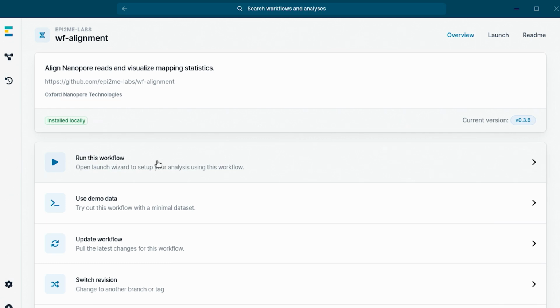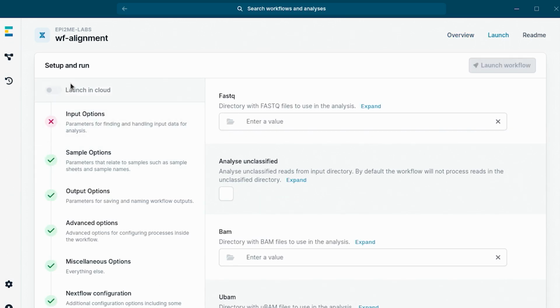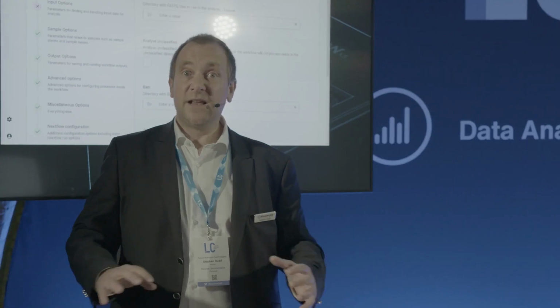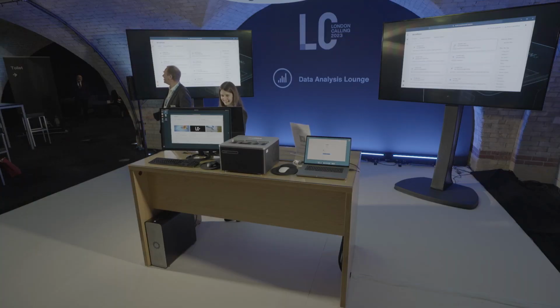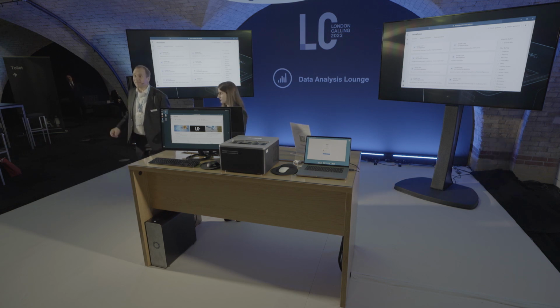What you do is you just specify that you would like to work with the cloud, you build a little bit of infrastructure, you submit your jobs to the cloud. The jobs run in your own environment, it's clean, no data is retained, lots of data is returned. Hey, everyone was listening, I like that. Anyhow, you get some glorious results back, you get some beautiful reports, and lots of data that builds confidence. Anyhow, let's have a look at a couple of examples.